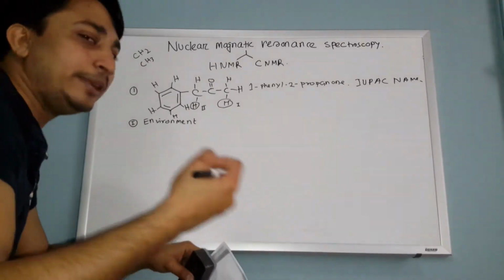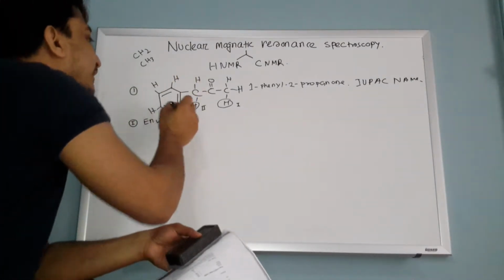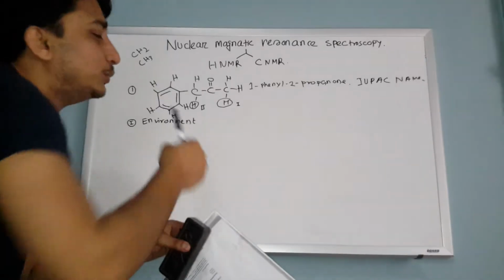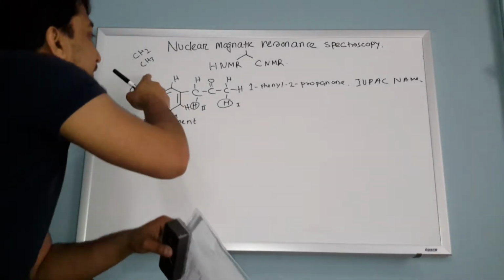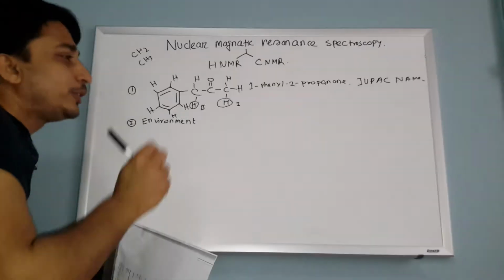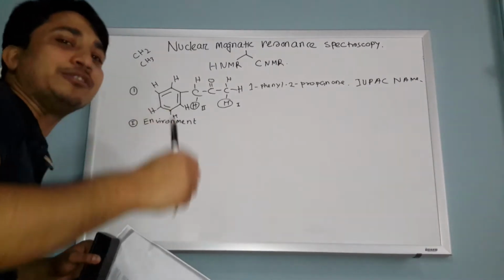Because there is just a little bit of difference. Books mention all hydrogens in there as one environment because the differences between all the delta values are really little. So that's why they say all the hydrogens there are one environment. But this is not true, because a little bit of difference means a difference. Any kind of difference is a difference.